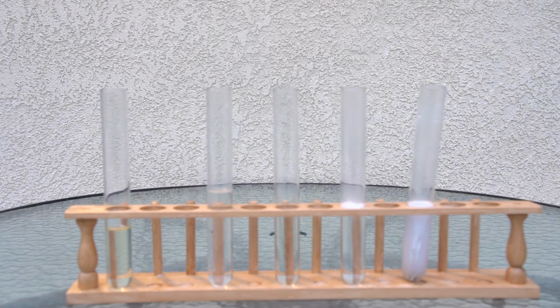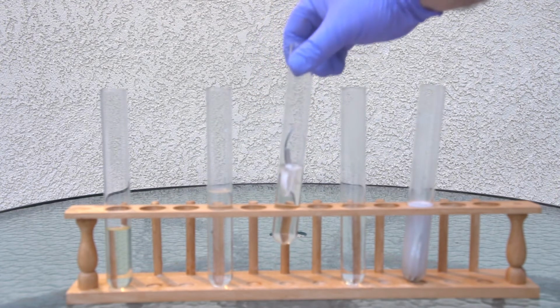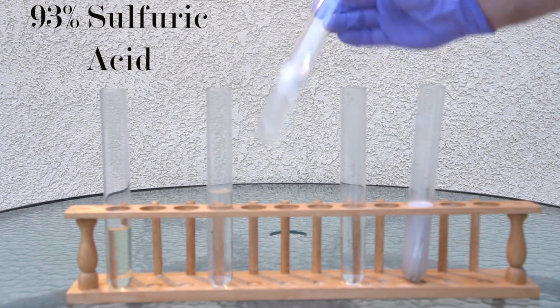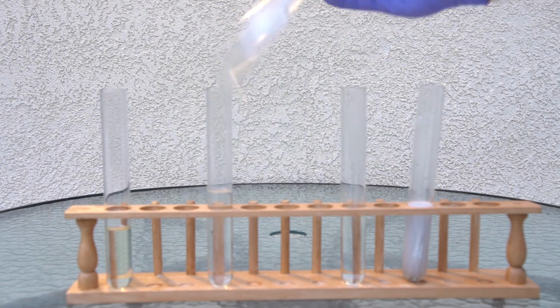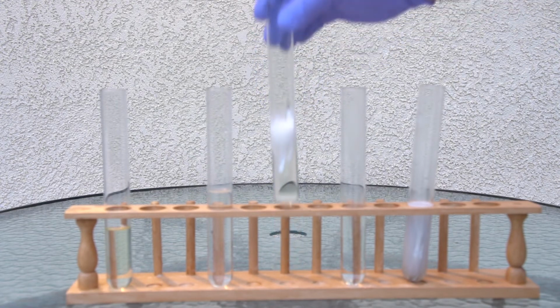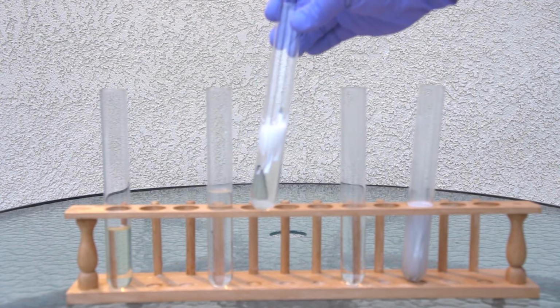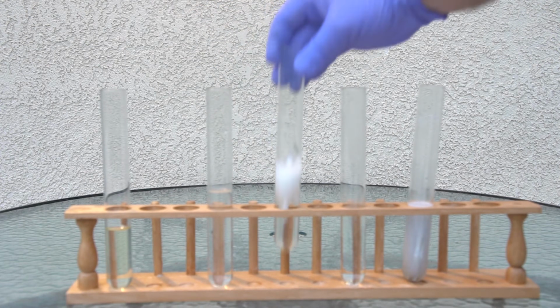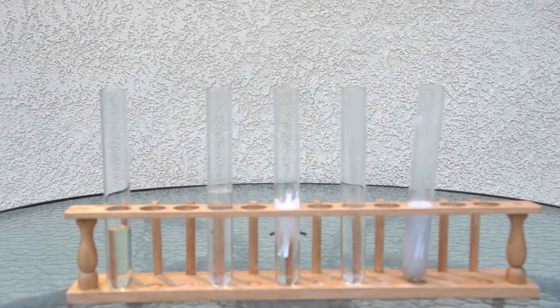Next, we added the magnesium to the sulfuric acid. Interestingly, there was not much reaction in this case. We had produced these results on a different day, and it seems like other people also report not a strong reaction with concentrated sulfuric acid. Perhaps the acid has trouble breaking through the passivation layer of the magnesium oxide. We're really not sure. Anyway, there was not too much reaction there.